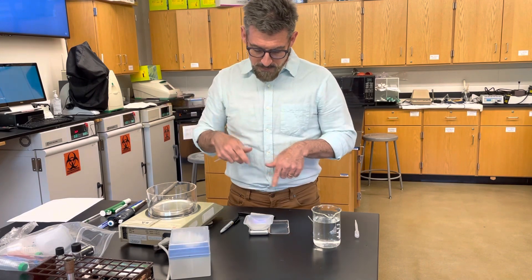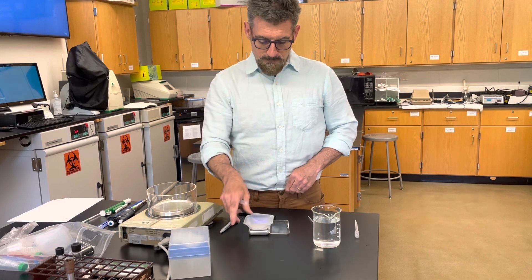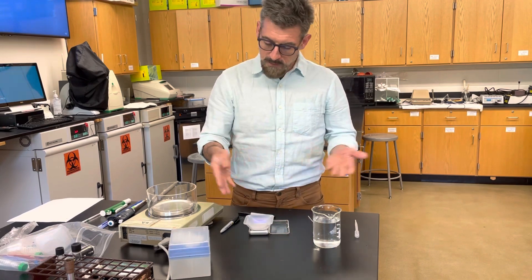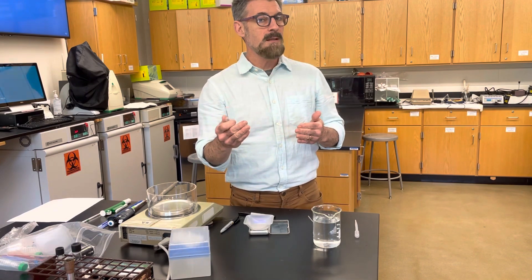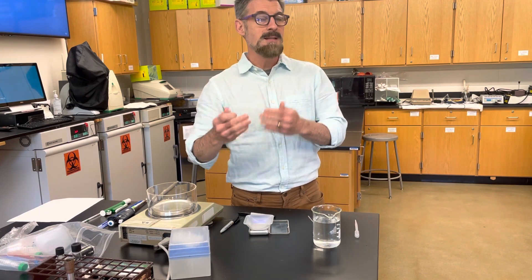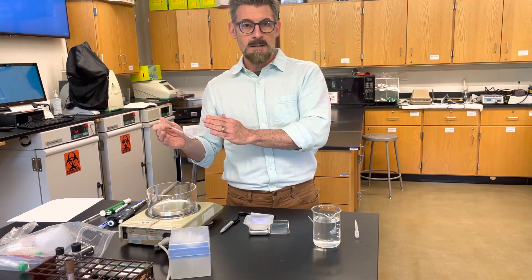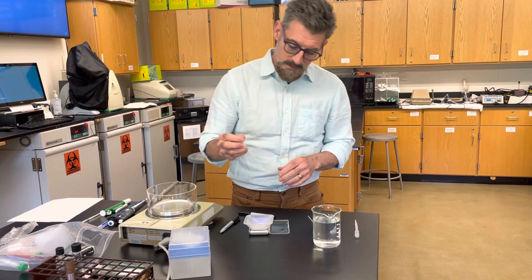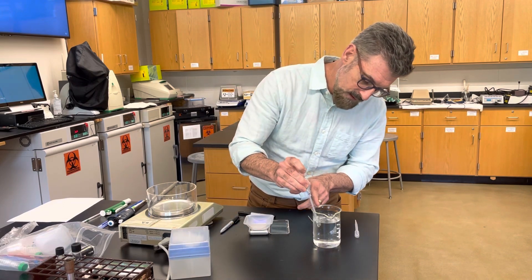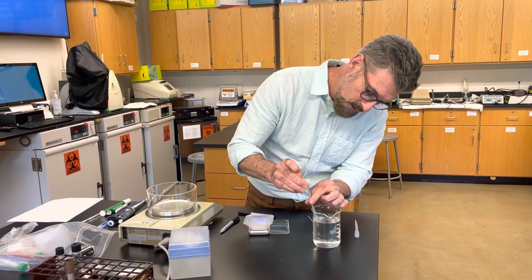Turn on your balance if it's not already tared. Tare it, and put your weigh boat on — or if it's already on, it'll just be tared with the weigh boat. Now I'm going to start at one milliliter, ten times. Then you'll do 0.5 milliliters ten times and three milliliters ten times. So you draw your pipette up to the one mil mark.